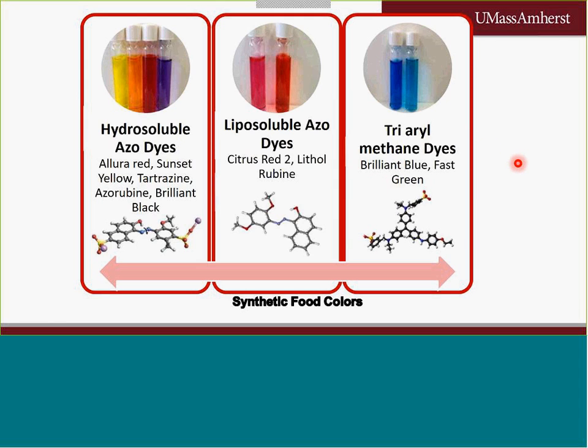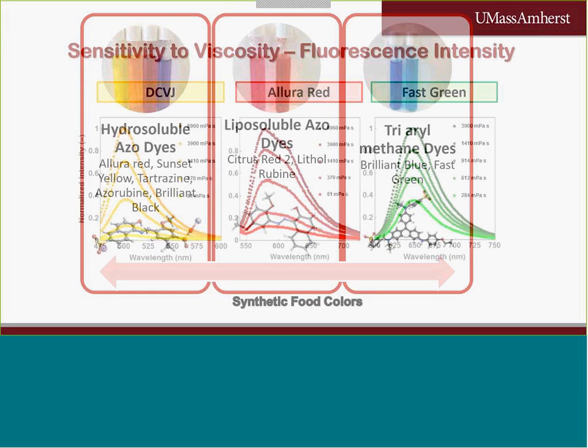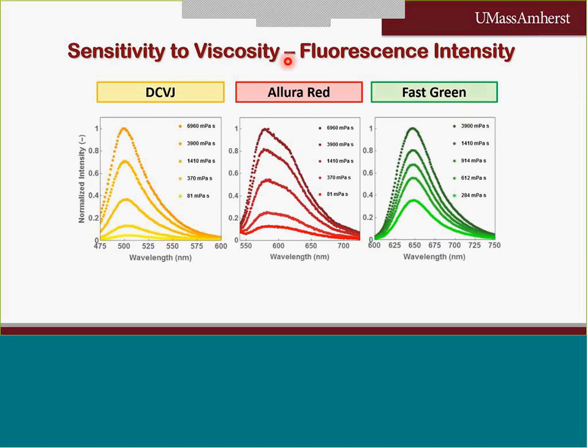Of course, in order to test the capability of them to operate as molecular rotors, they have to withstand the typical experiments that are being performed in order to test a synthesized probe as such. So basically, these kind of experiments involve the sensitivity to the viscosity of the medium in terms of their fluorescent intensity.